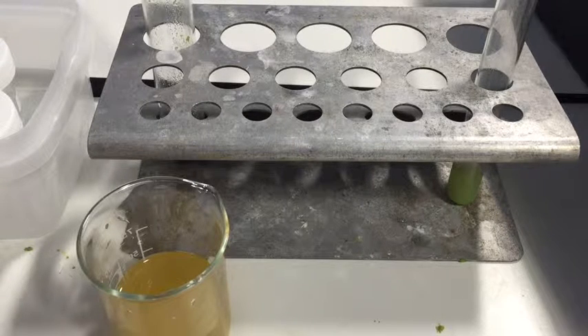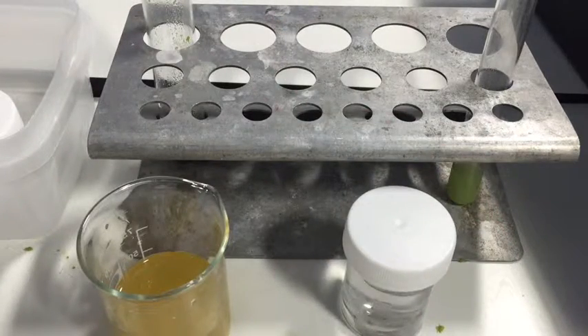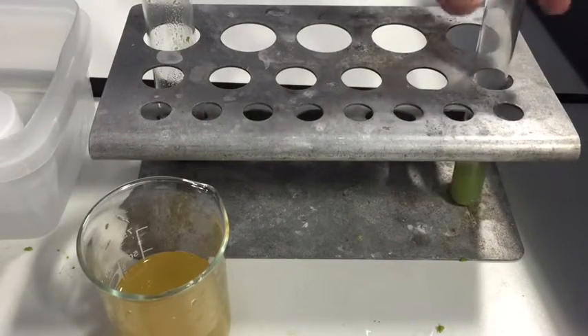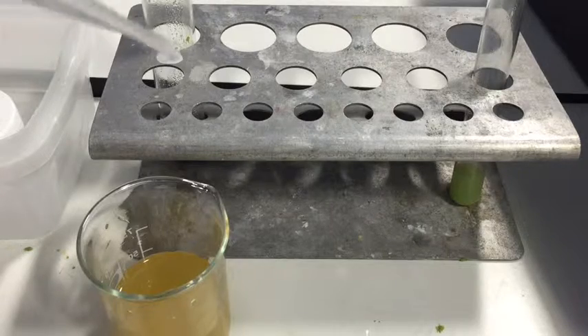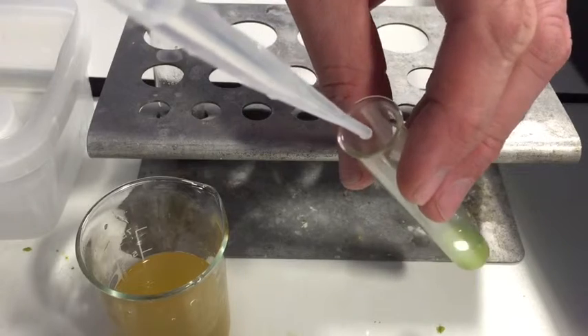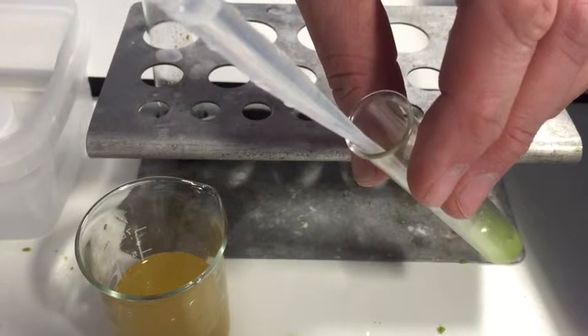Now we're going to actually extract the DNA using a technique where we take ice-cold ethanol. It's really good to use purple methylated spirits because you get a lovely mix of green and purple, but we just have clear ethanol. We're going to add it very slowly so it doesn't mix — it forms a layer over the top. Run it down the side of the tube. This creates an interface between the two liquids — one more polar than the other — and the DNA will accumulate at the interface between the water phase and the ethanol phase.